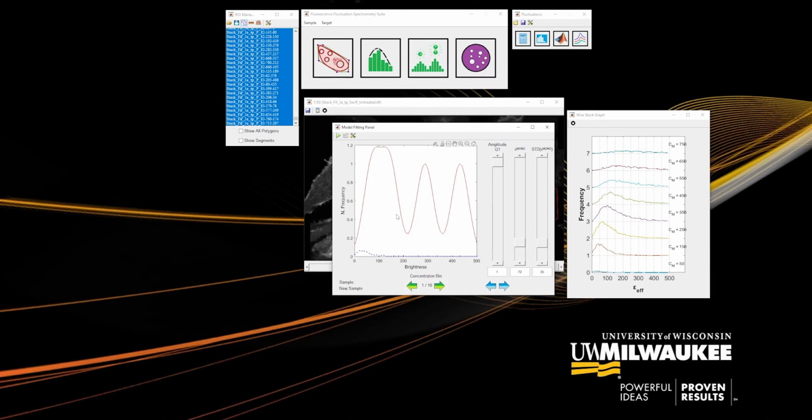In order to do a manual fitting, you can adjust the amplitude of each Gaussian curve using the slider above the 2 blue arrows. The text at the top of the slider tells the user which Gaussian is being adjusted with the slider bar. To adjust Gaussian 1's amplitude, drag the slider bar down. To move to other Gaussians, click on the blue arrow buttons and then drag the Gaussian's amplitude down. You can see that the axes scale with the Gaussian amplitudes, which help us visualize the data easily. You can manually continue to refine the fit.